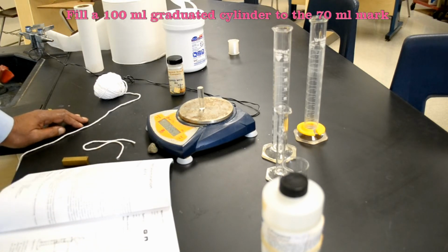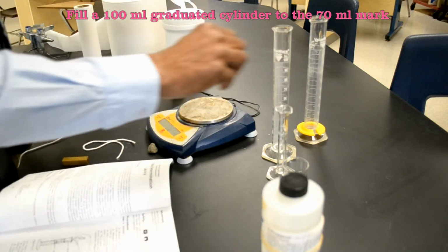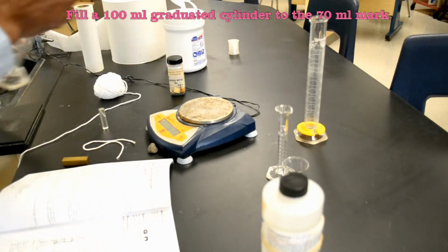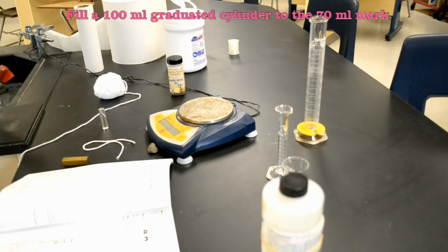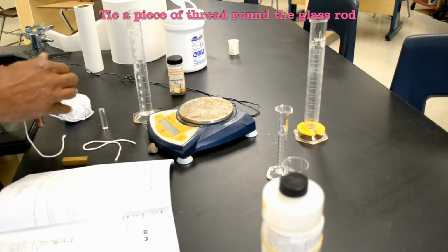Then it says fill a 10 mL graduated cylinder with tap water to about 7 milliliters. Since this rod is much larger than a 10 mL graduated cylinder can hold, I'm actually going to use a 100 mL graduated cylinder. I'm going to fill it up to about 70 milliliters. That's 70 milliliters.